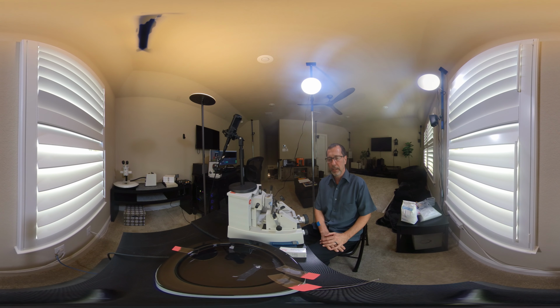And once that's done, keep in mind it's hot melted paraffin that's perfused in the tissue at this point. It gets carried over to embedding. And again, paraffin is used in this area as well.